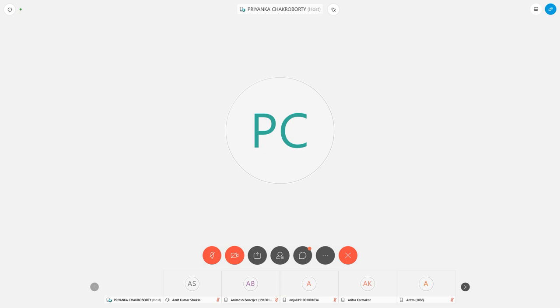Here we will see the procedures for identification of carboxylic acids, aldehyde and ketone. Now, previous day I have only discussed the tests for aldehyde and ketone: the 2,4-DNP test for both the carbonyl groups, aldehyde and ketone. Then for the aldehyde group we have seen the Fehling's test, and for the ketone functional group we have done the sodium nitroprusside test discussion. But in this video there will be two more tests, that is Tollens reagent test and another one, Schiff's base test.